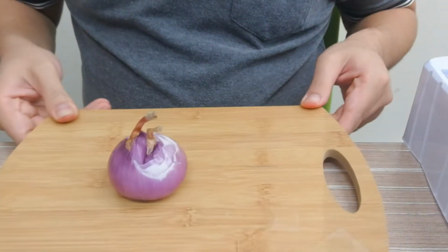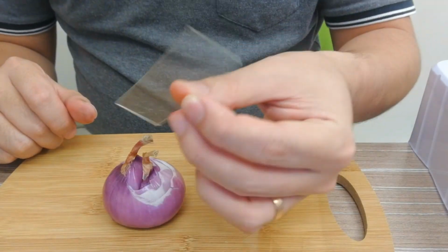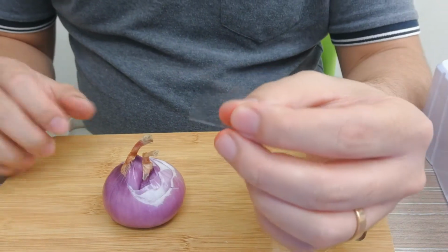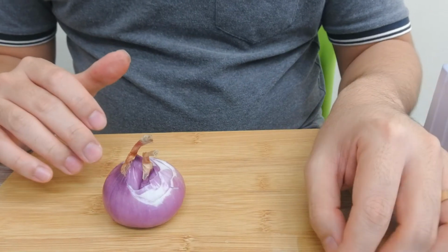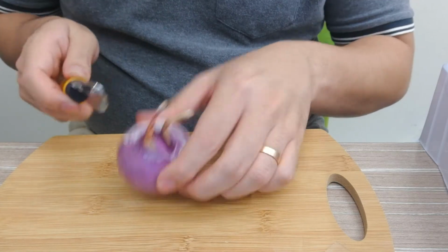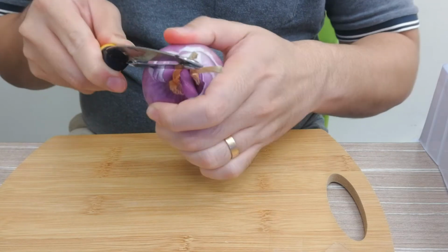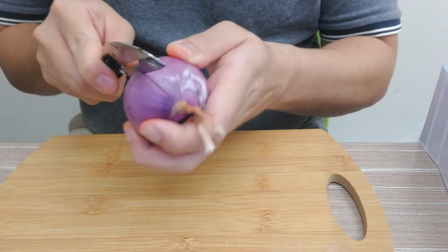Each student will have 3 empty slides, and also the slide cover. Some specimens we need to use a microscope slide cover, for example onion, and some no need. To extract the onion skin out from the onion, you need to get this part. When you cut, you can just cut half. I don't want to cut it all because I want to keep it for my class.